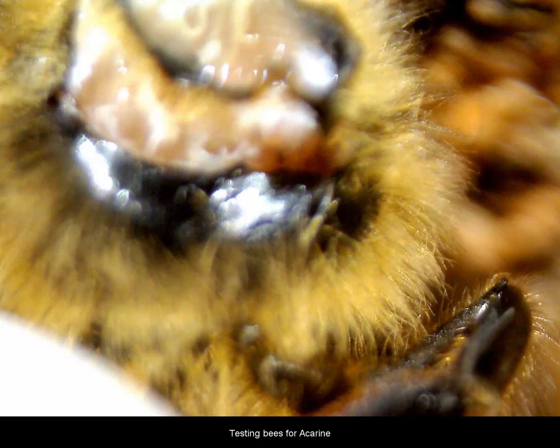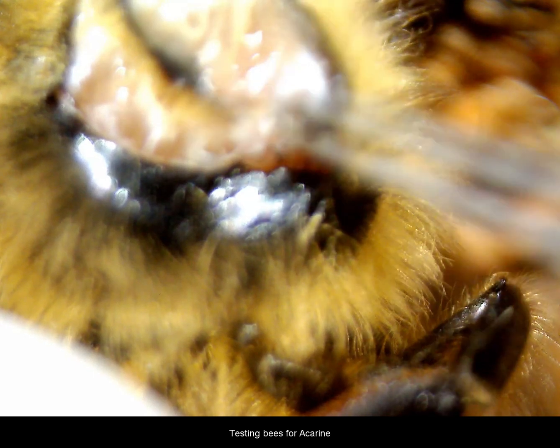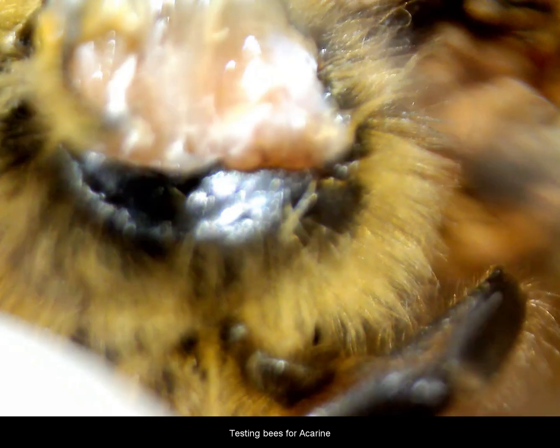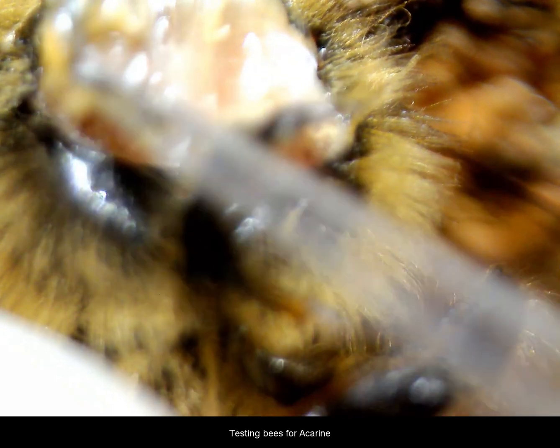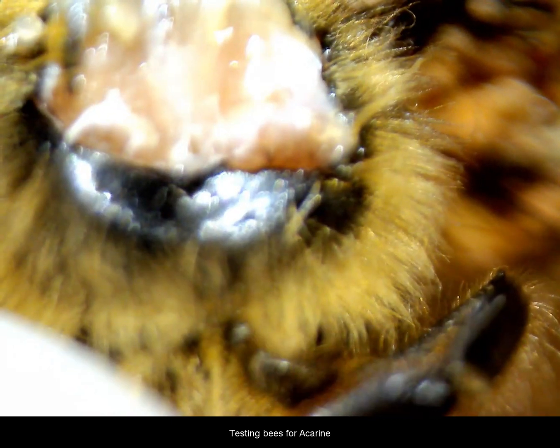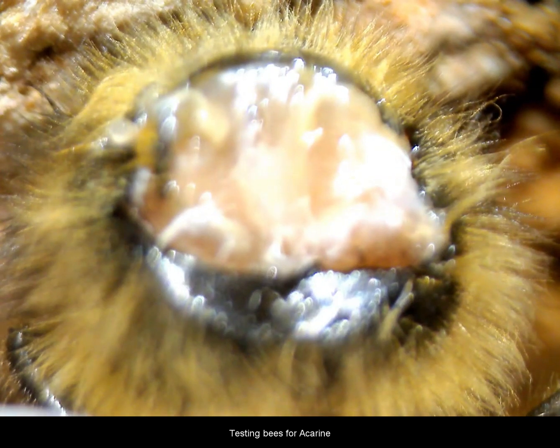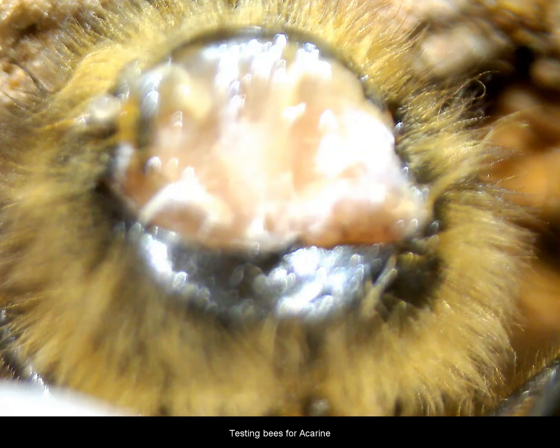Once it's scored, you take your forceps and try to lift off the collar itself. Sometimes with practice it will come off in one go; other times you'll find bits of it left behind. You'll find that the fresher the bee is, the easier this job is to do. Here on the left hand side we have to root it out a small bit just to get the last piece of the collar out of the way because it's covered over with some material there.